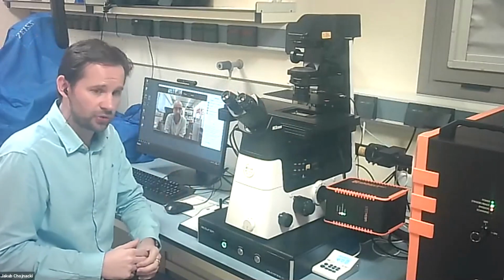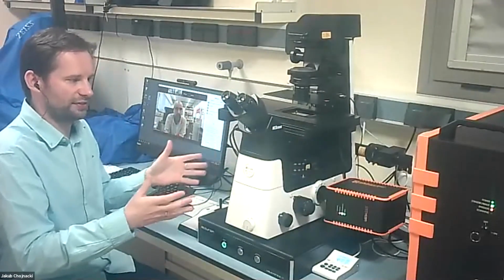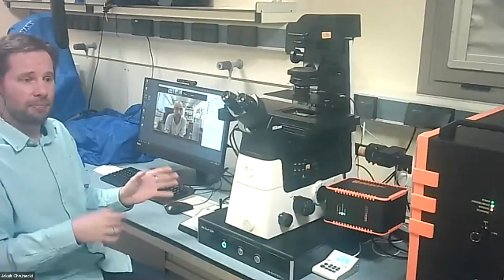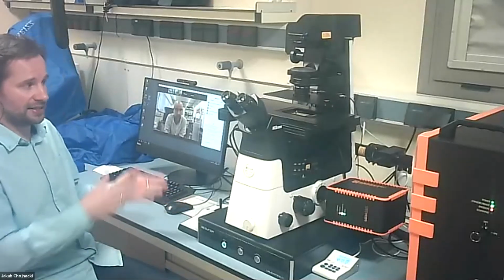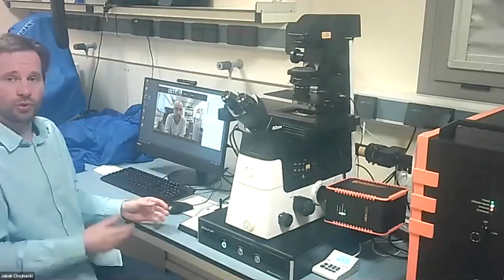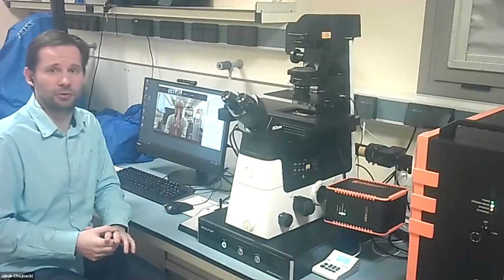Definitely, microscopes can be used for high throughput studying. This microscope is more of a research microscope, so we do not have this kind of capability. But many companies offer this sort of microscope. They are often used by pharmaceutical companies which want to look at a lot of different drugs, for example, and scan many microscopy samples treated with different types of drugs. So yes, that is quite possible.